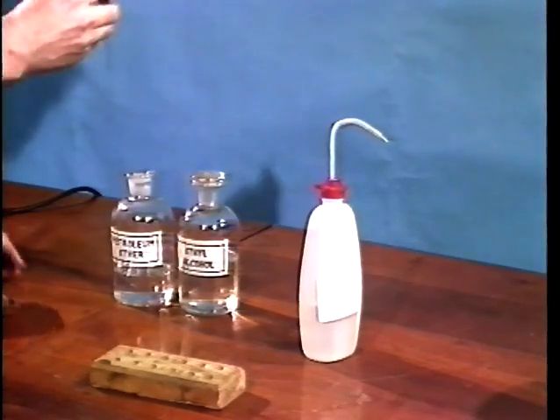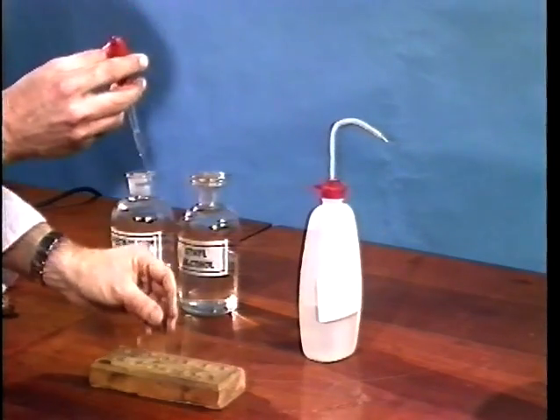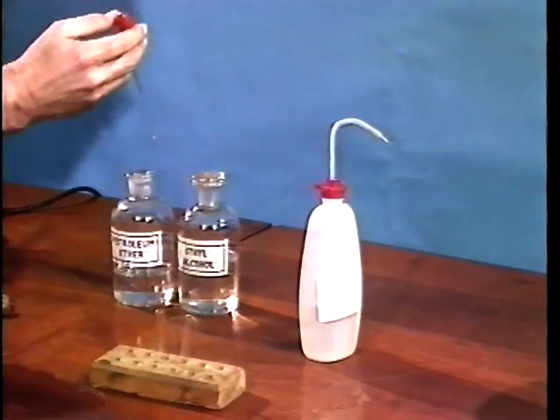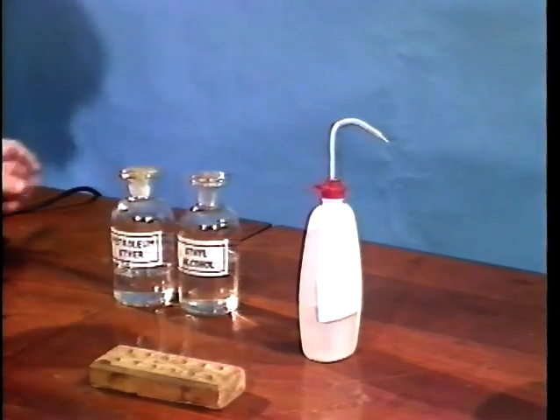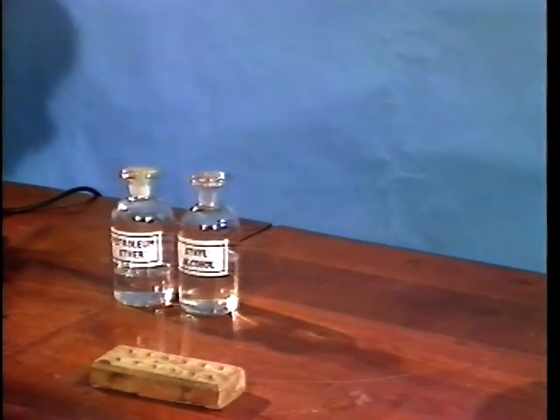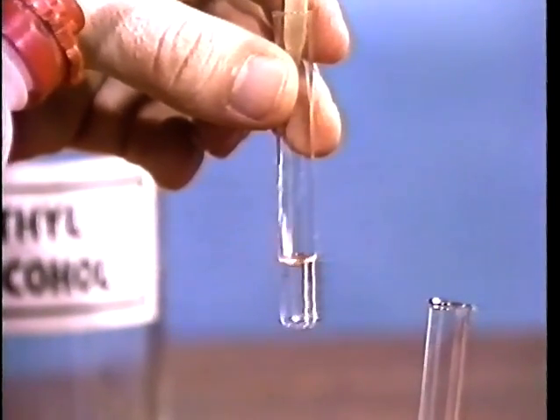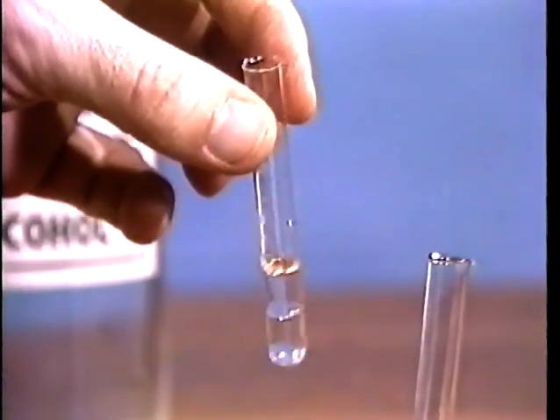Sometimes it is difficult to find a single solvent from which you can recrystallize your solid. In this case we resort to a mixture of two solvents. If, however, the two solvents prove to be immiscible and form two layers, as in this case, then they cannot be used for recrystallization.